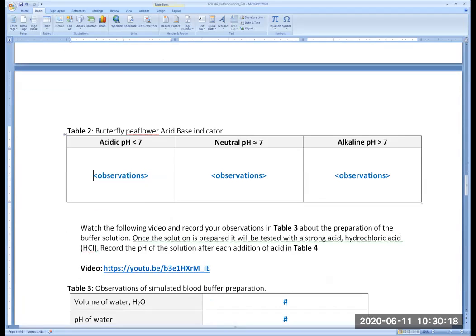Is it just water, or is it a solution of maybe carbonic acid or something? So tell what it is, the name. You will see she reads the pH with the probe, so you can have an electronic value for the pH.